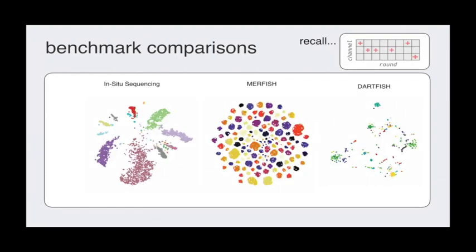The other cool thing you can do are these interesting analyses of the data. So for example, recall that when we're finding our spots, we're measuring their intensity values across rounds and channels. So you can imagine I have a matrix where each row is a spot and each column is an actual index into a round or a channel, and each element in that matrix is the intensity of that spot. And now for all of those spots, I've also decoded them. So I know what those genes correspond to. So when I have a matrix, I can project it into 2 dimensions.